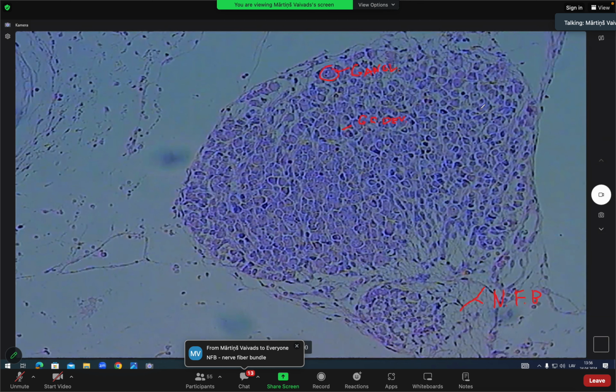We have 5 minutes left. We need to check one of the more complicated slides, brain development. Brain development, 11, 12 weeks. We will need to finish with that slide. Some slide variations, we can discuss them during consultation times because there's quite a lot to check.